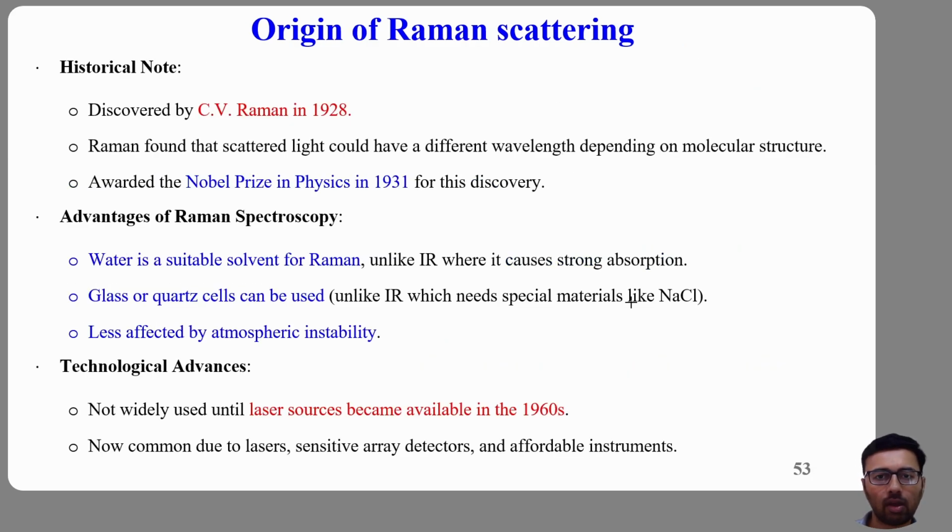So let us now examine the origin of Raman scattering more carefully. Suppose we shine monochromatic light onto a molecule. Most photons scatter without changing energy. The outgoing photon has exactly the same frequency as the incoming photon. This process is called Rayleigh scattering. Rayleigh scattering is overwhelmingly dominant. In fact, Raman scattering is extremely weak, typically only about 1 in every 10 million photons undergoes Raman scattering.